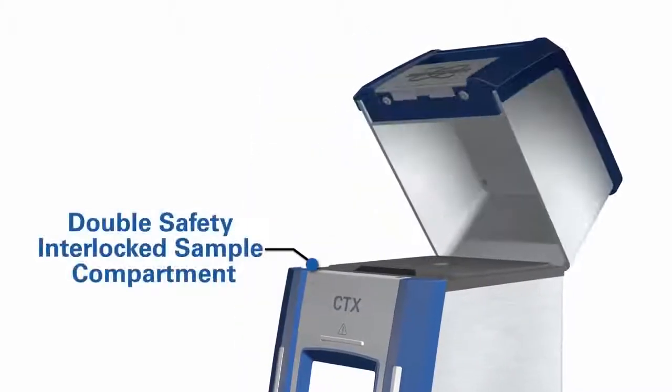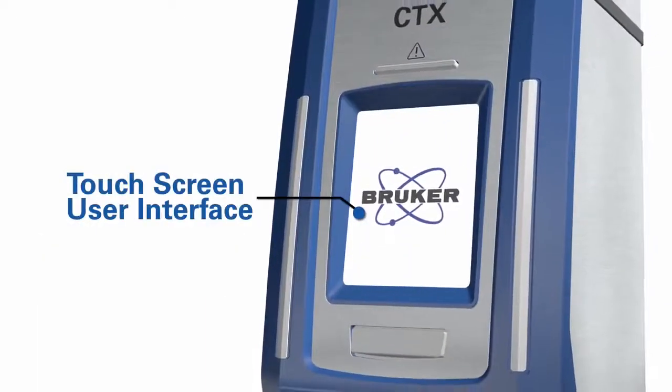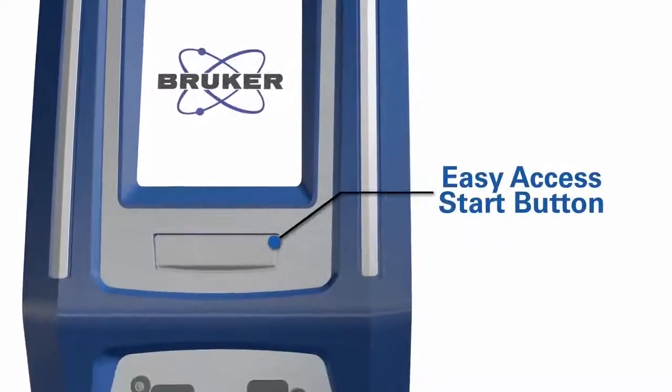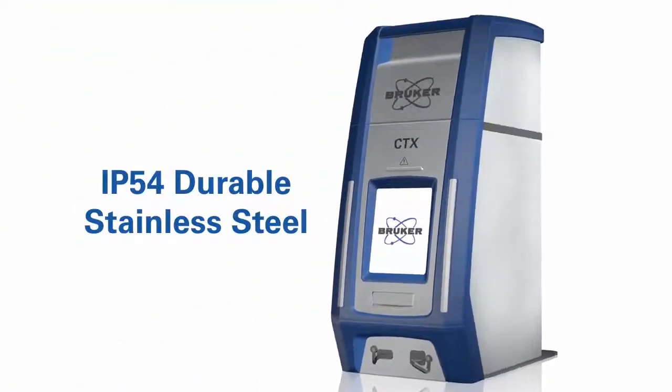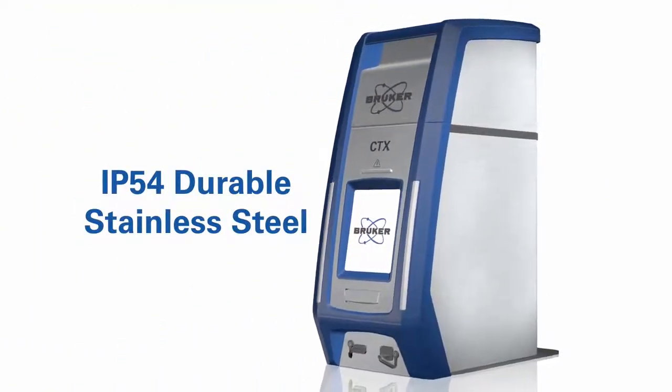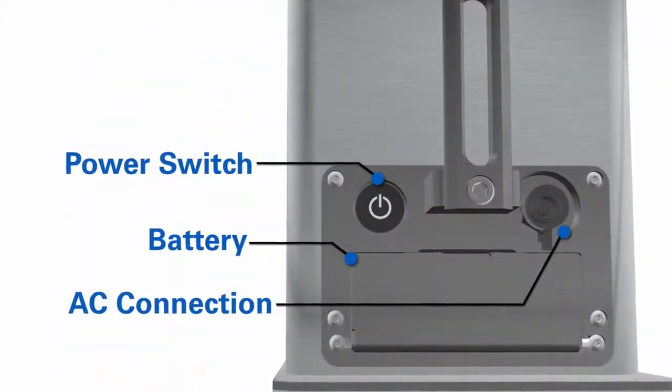The CTX has a double safety interlocked sample compartment, a touchscreen user interface, and an easy access start button, all encased in IP54 sealed durable stainless steel. The battery, AC connection, and power switch are located at the back of the unit.